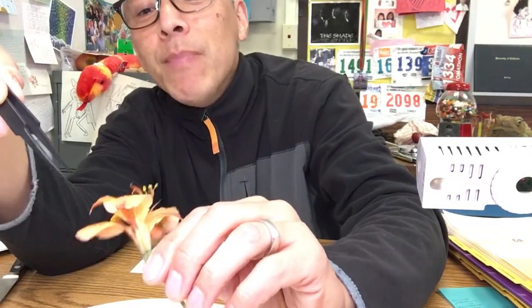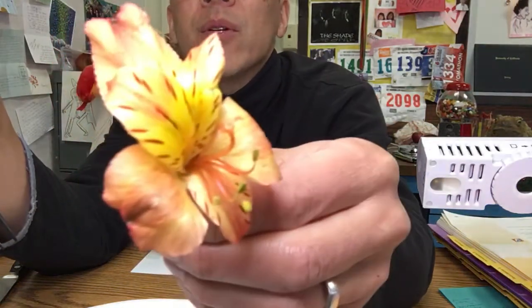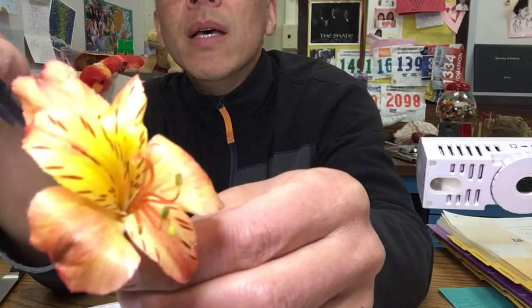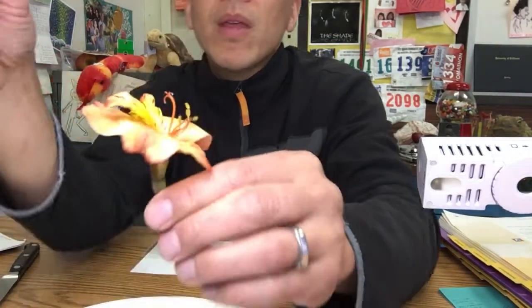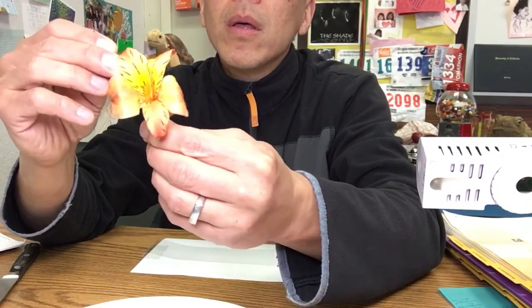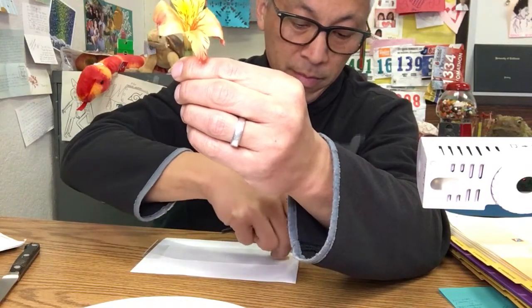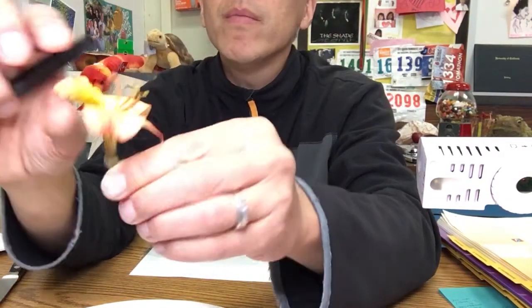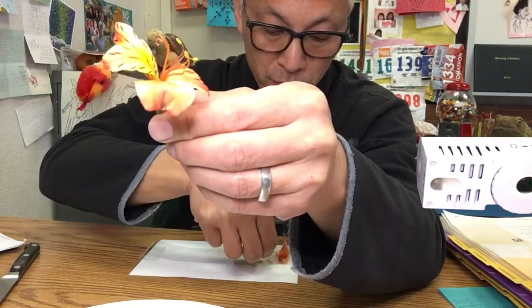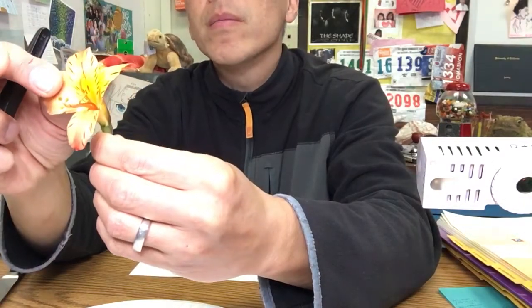the sepals. And on this kind of flower, the sepals and petals look very similar to each other. But we're going to take the outermost three as sepals. I'm going to carefully peel those off. I'm going to put them on my flower mount over here. There's one. There's two. There's three.